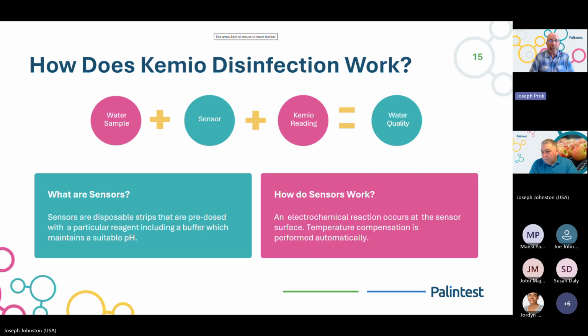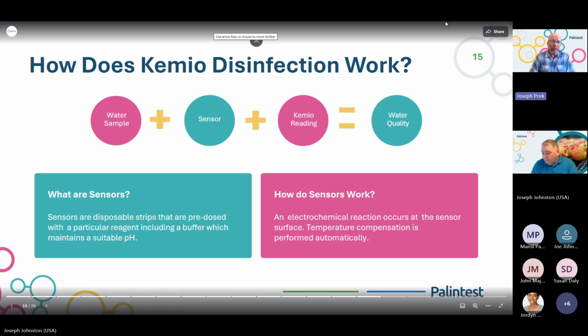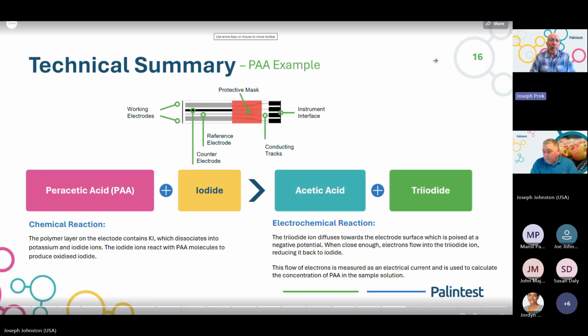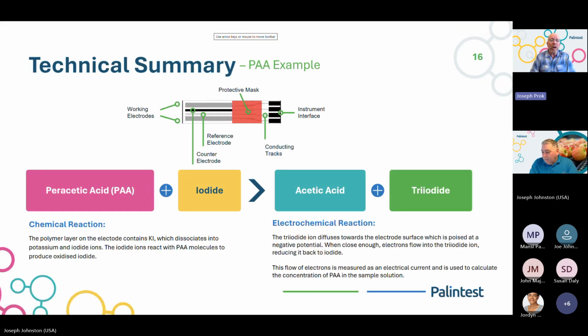So you've got the substrate, you've got the electrodes or these electrode strips, and then lastly, what we do is apply and dry a chemical reagent on there that is a chemical compound that when it comes in contact with water, this compound disassociates from itself.